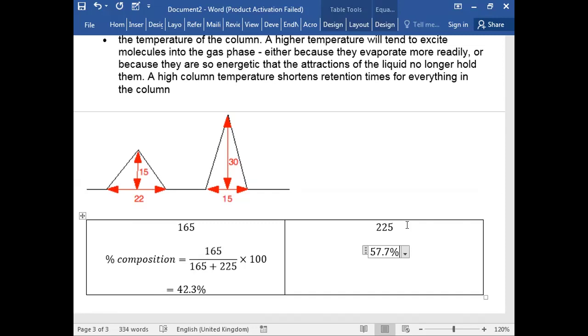Retention time, please be very clear कि इसमें your stationary phase is a non-polar liquid, high boiling point liquid. मैंने कहा imagine it as a wax. That will help you understand. जितना ज्यादा नॉन पोलर और हाई बॉइलिंग पॉइंट सब्सटेंस होगा उतना ज्यादा स्टिक करेगा, उतना ज्यादा उसका रिटेंशन टाइम होगा. Is this clear?